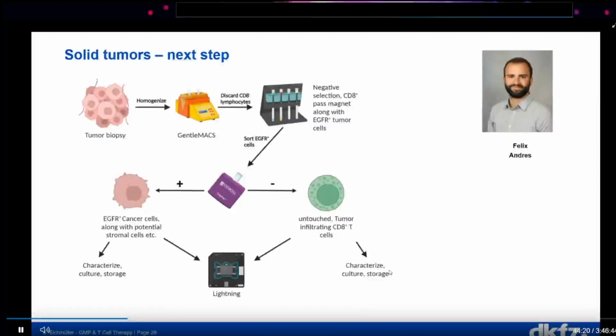At the moment we try to go on with these kinds of experiments and go for solid tumors, which of course have some other challenges, because tumor cells from solid tumors are normally adherent, and this may hamper the panning of the T cells.